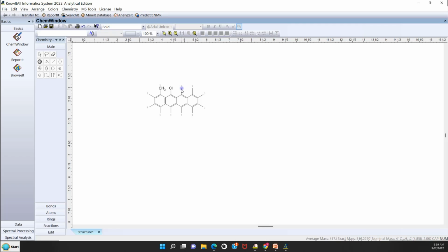If you go over to the next one and put H, you get a hydrogen. If you hold the Shift key and put H, let's see what we get. You get another defined group that they think is useful. I'm not quite sure what that one is myself because it's not a common one for me. Let's go down and try phosphorus, which you just type the P on your keypad. And again, you can click on that by just continuing to type P again. It keeps stripping the hydrogens off if you want to do that. Let's come down to the next one and now hold the Shift key while we type P, and you get a phenyl group, which is somewhat useful.